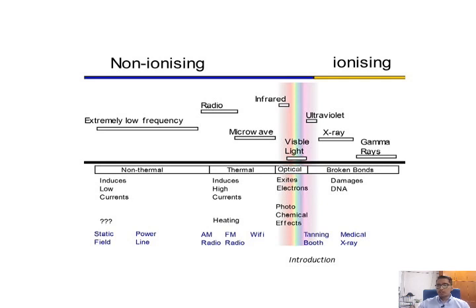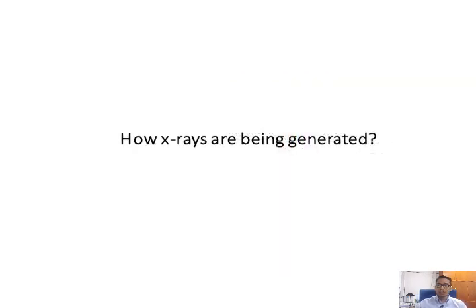Alright, so basically how are X-rays generated? The X-ray tube is the medium and platform for X-ray generation.